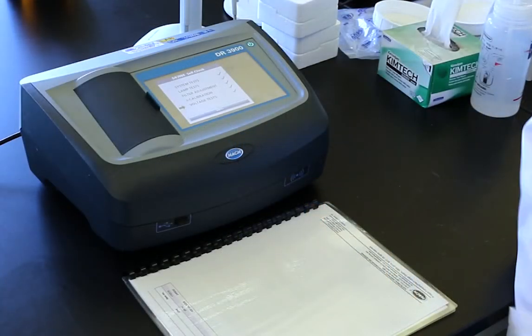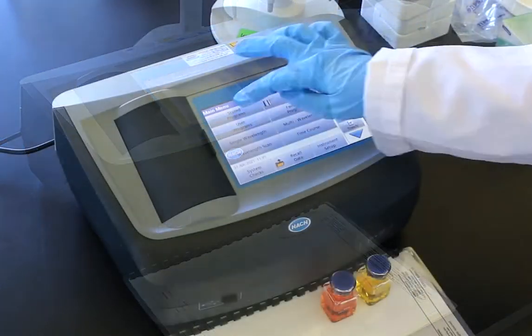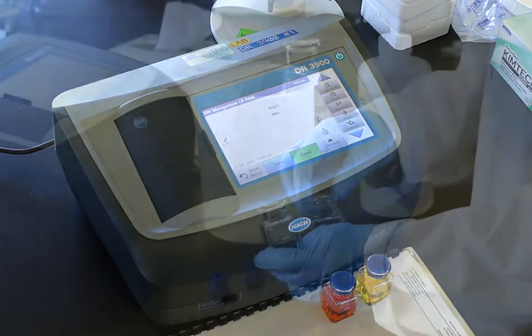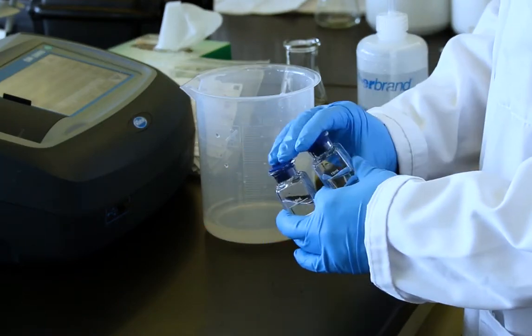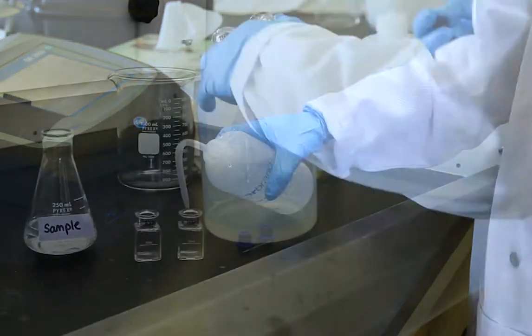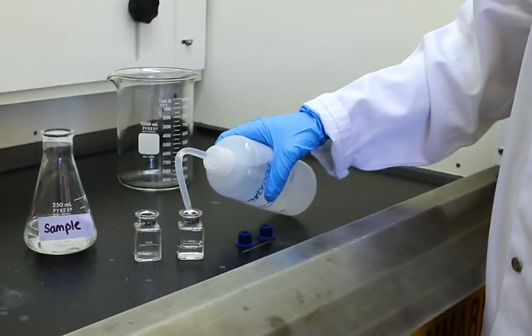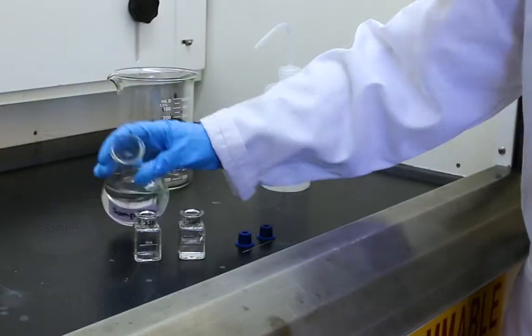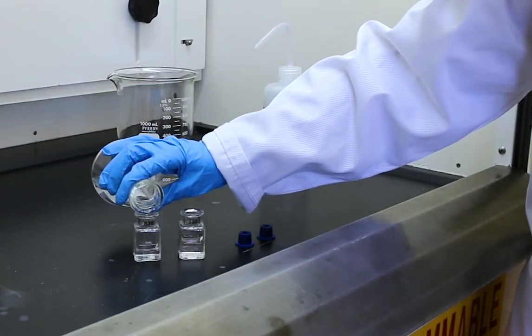Power on the instrument and select the appropriate program. Rinse the set of sample cells with deionized water. Fill the blank cell with deionized water to the line. Condition the sample cell with the sample water and then fill it to the line.